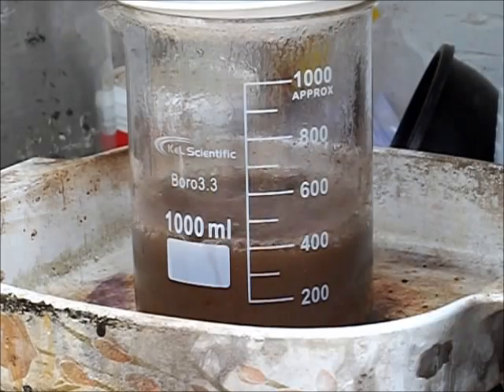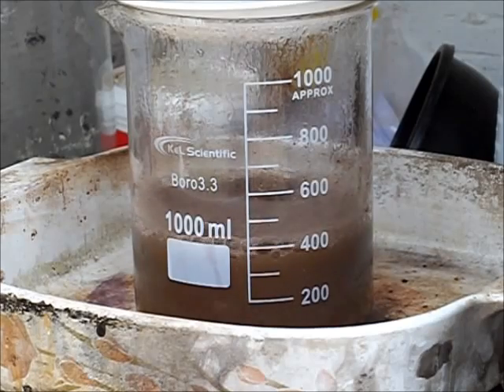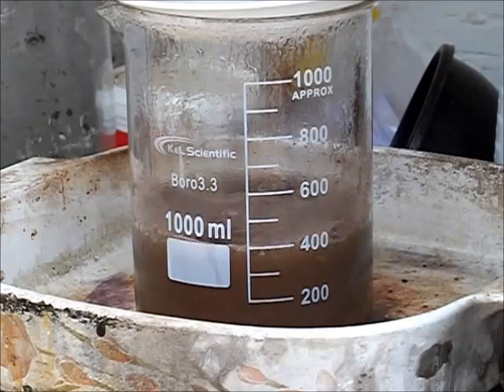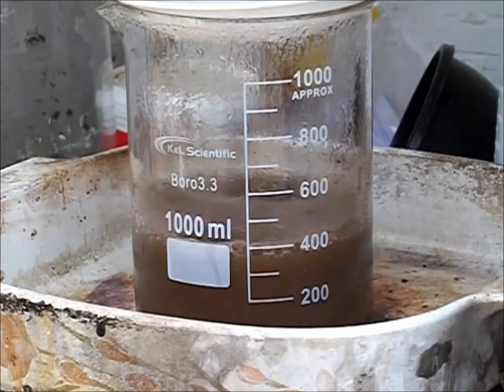We're back with the wash and it's been boiling now for about 30 to 40 minutes. It's time to cut the heat off and let it cool down. I'll come back, we'll test the solution to make sure we haven't dissolved any gold, and we'll take a look at the solution and the powder to see if it's cleaned up any.